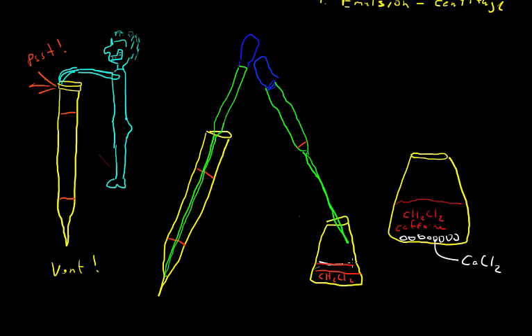And so there's no problem with that. All you have to do, if you still have moisture left in here, is add more dichloromethane, then add your drying agent, and then decant off the dichloromethane. Or if the drying agent's already in there, just add dichloromethane and decant off into another flask. The next step is boiling off the dichloromethane gently in the fume hood at very low heat. If you use high heat, this is going to splatter out of here. You boil off the dichloromethane, and that leaves the caffeine behind.